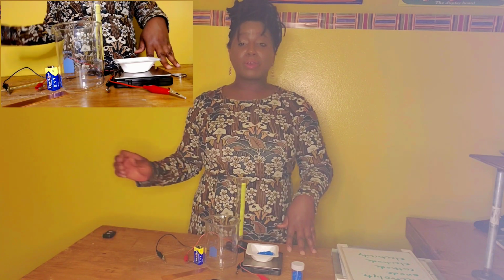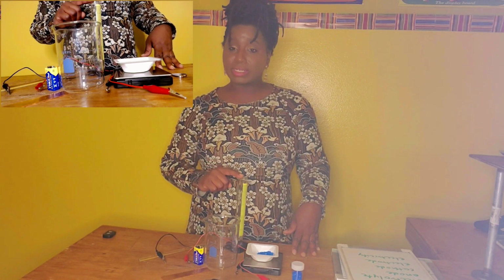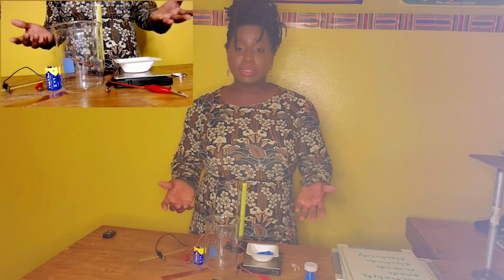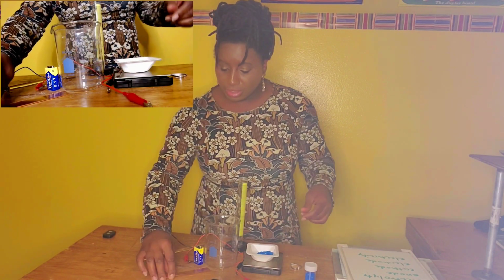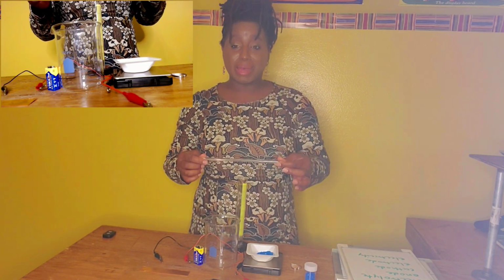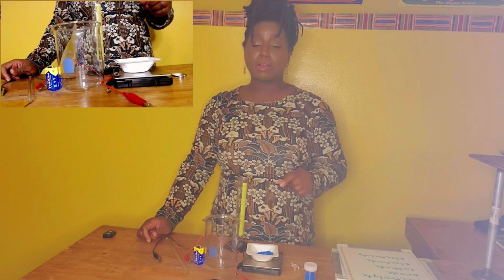So first, to start off, I'm going to go through some of the items that you'll need for this lab. You will need a beaker that's over 100 milliliters. You need a graduated cylinder. You will need distilled water, copper sulfate. You will need two leads, two wires. The best are the ones with the alligator clip. Yes. You will need a copper electrode and a glass rod or a rod that is not metal, like a wooden stick to stir. All right. You will also need a scale to measure out 10 grams of copper sulfate.